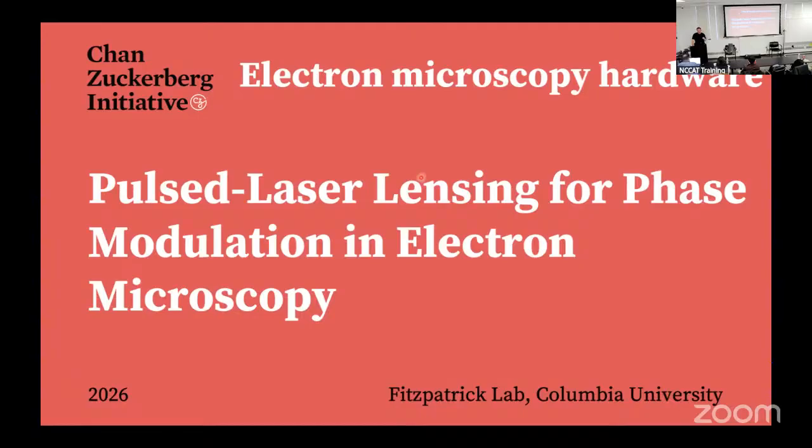So one of the ways that people are trying to achieve this in terms of the hardware side, which is what I was asked to talk about today, is these magnetic lenses are primarily just coils.